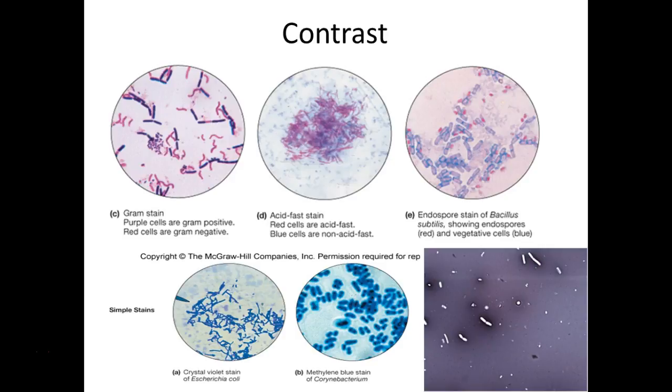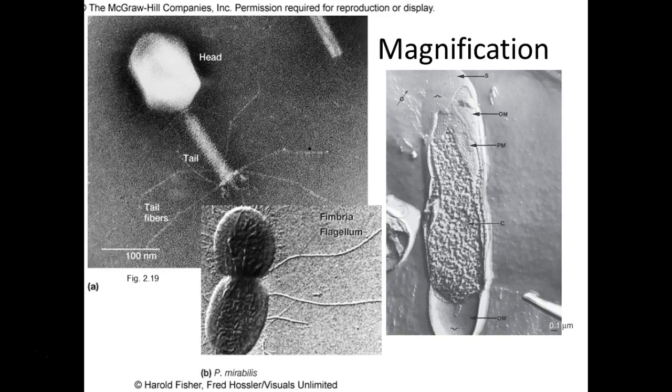Electron micrographs are grayscale, black and white basically. But then sometimes they'll go in and color it to visually help you understand what you're looking at and point out different characteristics. So it can be kind of confusing sometimes. And that's why, of course, it's always important to read what they write under the pictures as to what you're looking at, right?